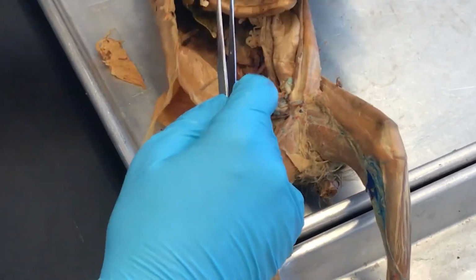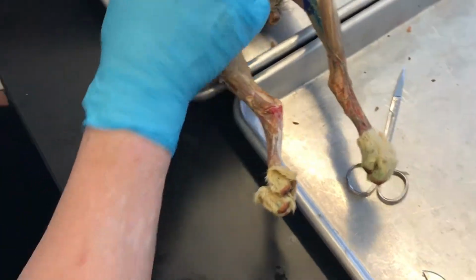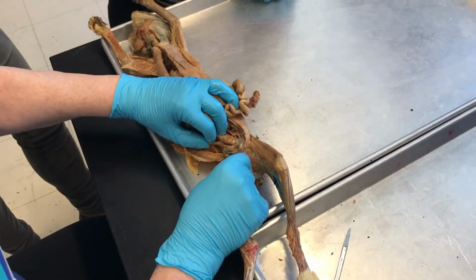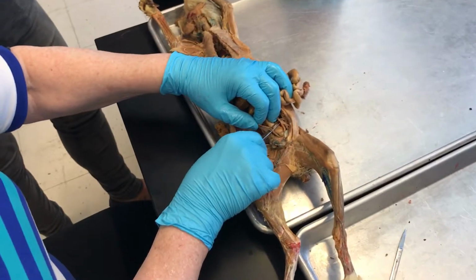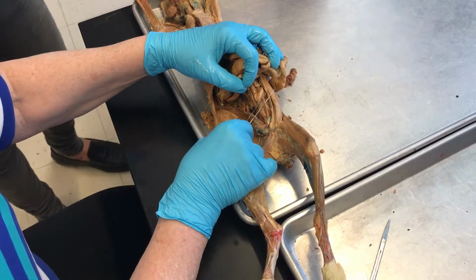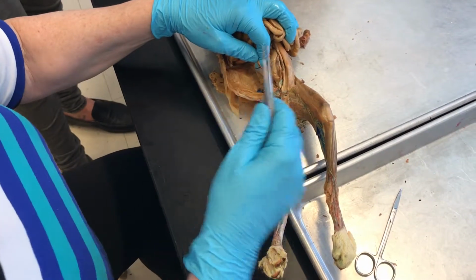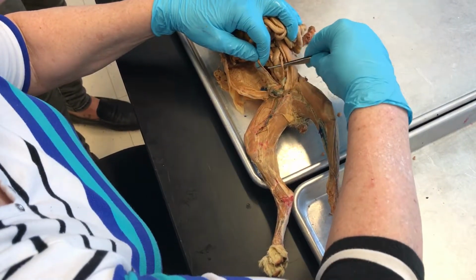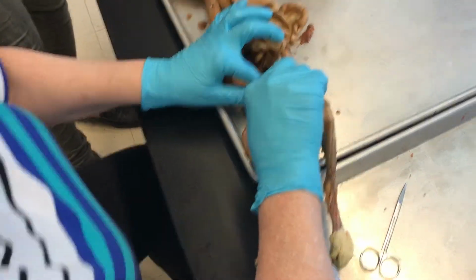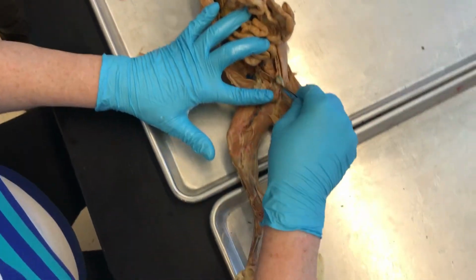There are many babies, maybe 6, 8. How many does a cat have, anybody know? Not that many, like 6, yeah. So that's why we have to have two uterine horns in order to have enough place for all that. How many does a human woman have? Humans only have one at a time, usually. Twins sometimes occur, but humans do not have uterine horns. They only have the body of the uterus. So we're coming here to see where the horns come together and form the body of the uterus. It's right here.